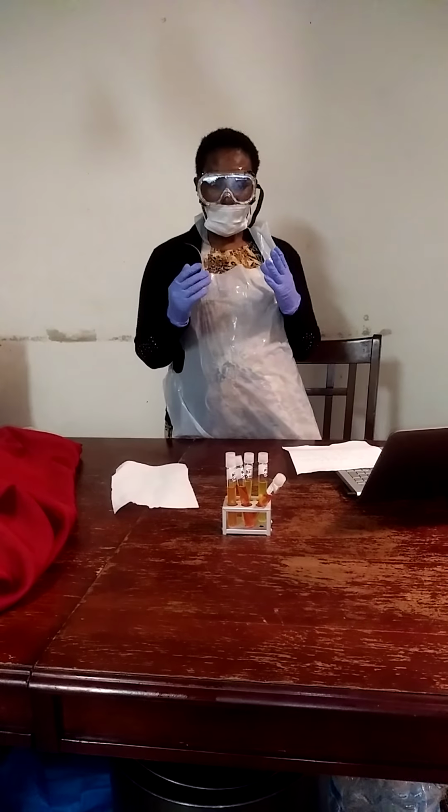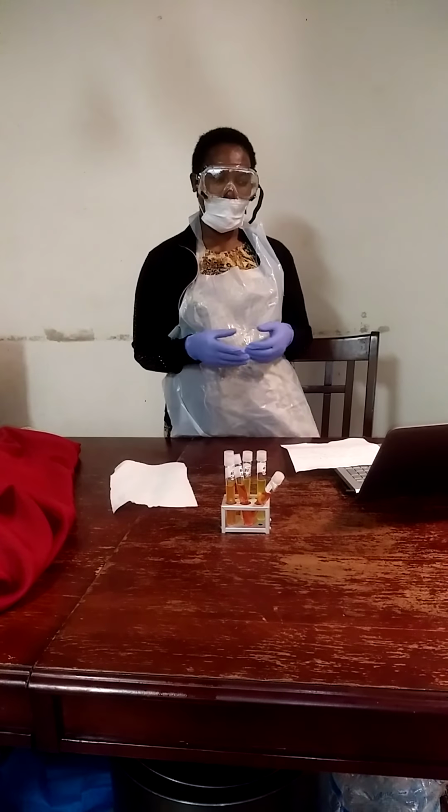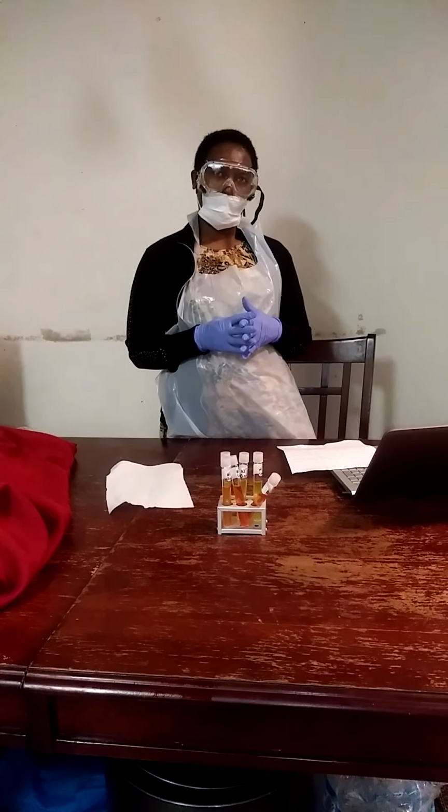And so that was my experiment and my results for this lab, biochemical testing for microbial identification, carbohydrate fermentation test.